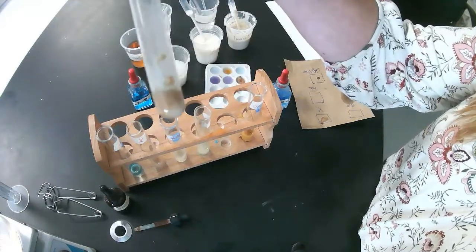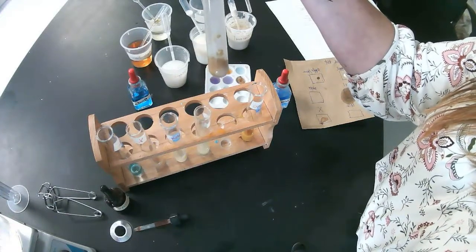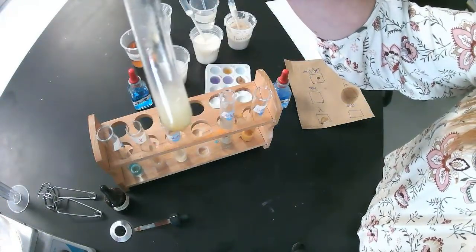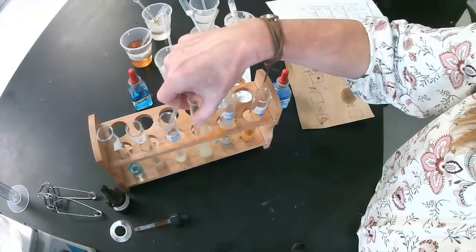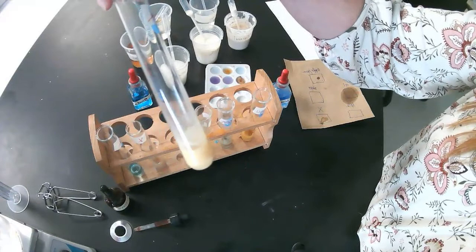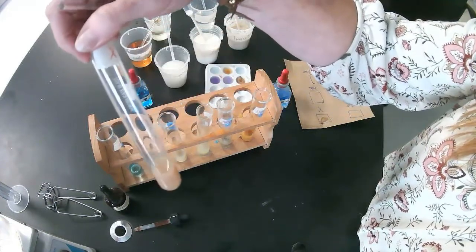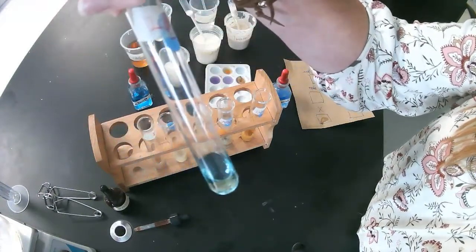And then the oatmeal, it just looks like disgusting oatmeal. Let me get rid of that. There we go. So that's negative for sugars. The oil also, it cooked, but it's negative for sugars. The milk has a little bit of sugar in it. So it's slightly positive, but not really enough to make a change. And then factor X did not change, and water, no change at all.